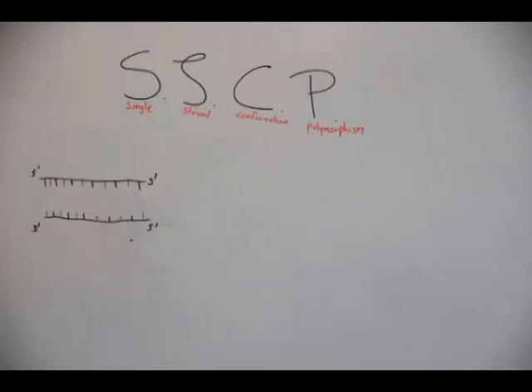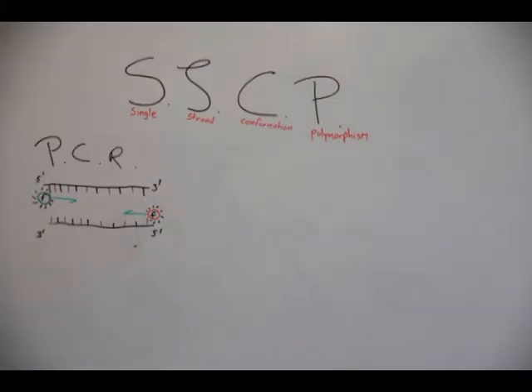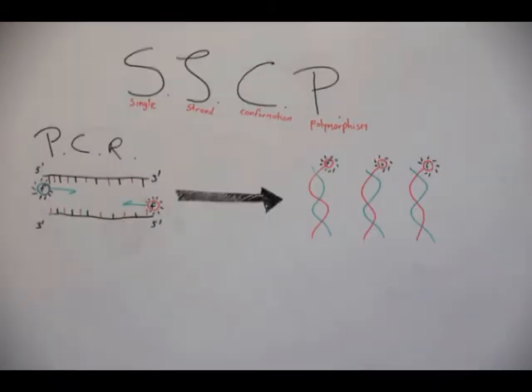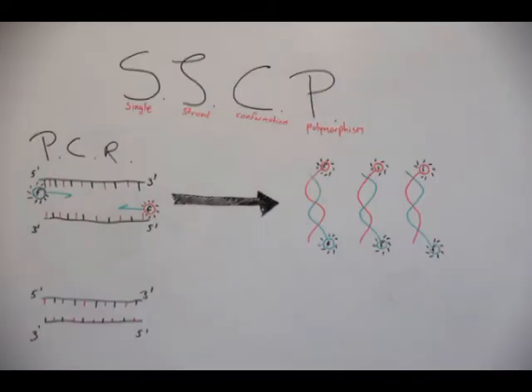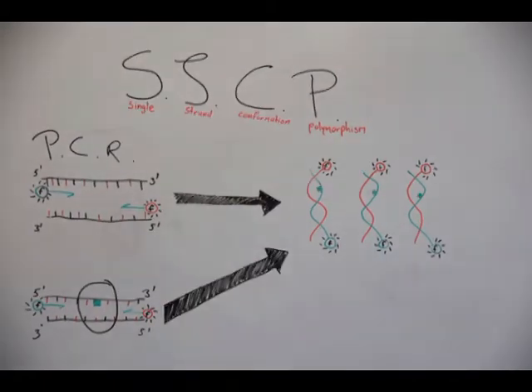After isolating the DNA, we will perform a PCR reaction. The targeted DNA is amplified during PCR. To target the exact region of interest, we will use sequence-specific primers. Each of the primers has a different color or fluorescent label. This is so you can recognize each strand during the analysis of the products.